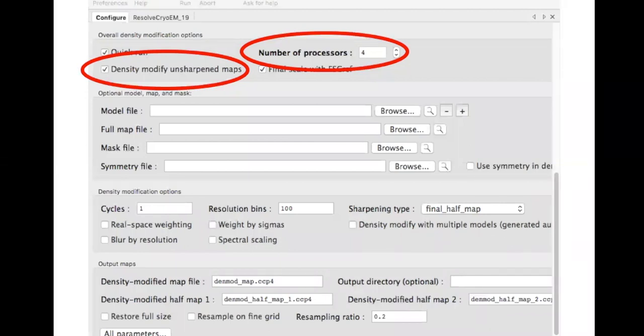So if you box the map, box it such that you include your entire molecule and a bit of solvent around it, such that your solvent content effectively is about 75%. That's what the program actually does itself. The first step involves boxing the map so as to get rid of the huge volume of pretty much nothing in most cryo-EM maps that extends a long ways. The reason the program does that is a technical one. It's a deficiency in the procedure.